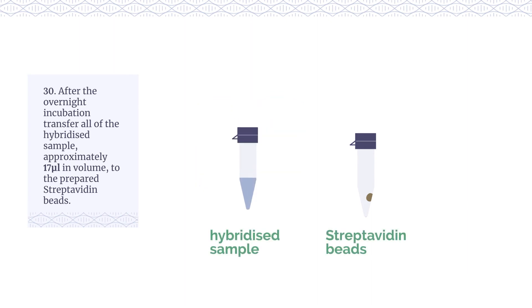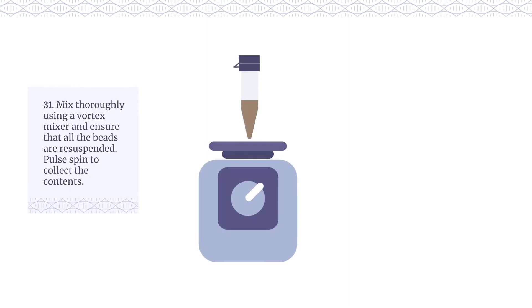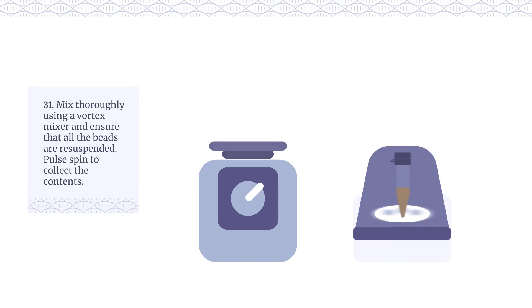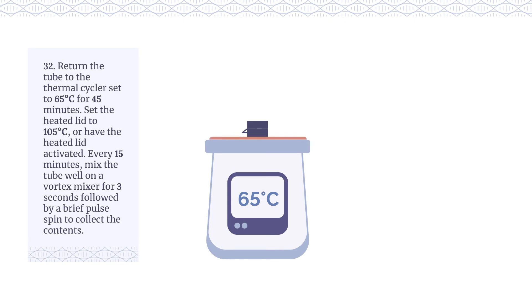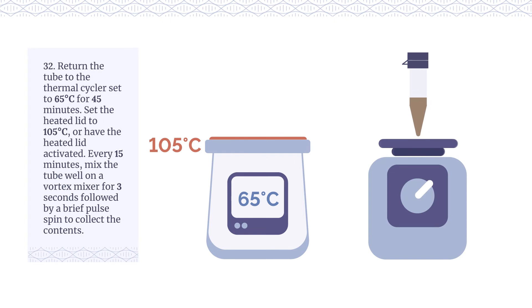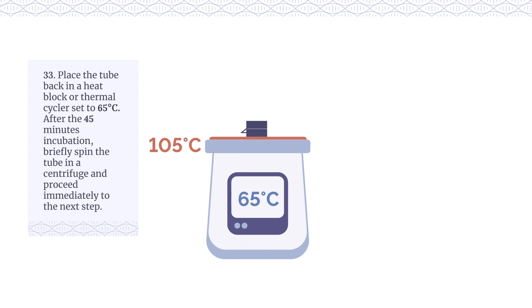After the overnight incubation, transfer all of the hybridised sample, approximately 17 µl in volume, to the prepared Streptavidin beads. Mix thoroughly using a vortex mixer and ensure that all the beads are re-suspended. Pulse spin to collect the contents. Return the tube to the thermal cycler set to 65°C for 45 minutes. Set the heated lid to 105°C or have the heated lid activated. Every 15 minutes, mix the tube well on a vortex mixer for 3 seconds, followed by a brief pulse spin to collect the contents. Place the tube back in a heat block or thermal cycler set to 65°C.